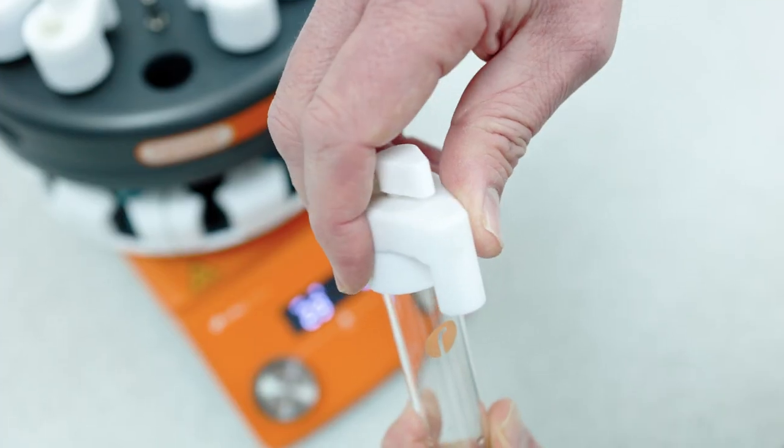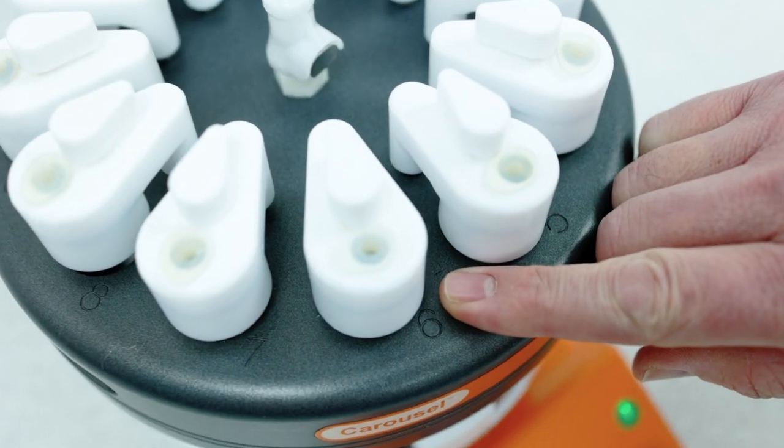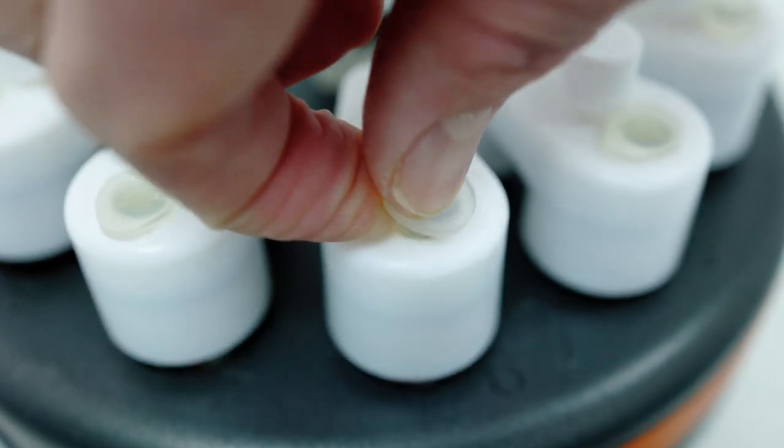It's then just a case of a simple quarter turn to put your EZON cap onto your reaction tube and lower it into the numbered position. In addition to the shut-off valve, we also have a septum to be able to make additions or take samples for analysis. We can also locate the external PT1000 for increased temperature accuracy.